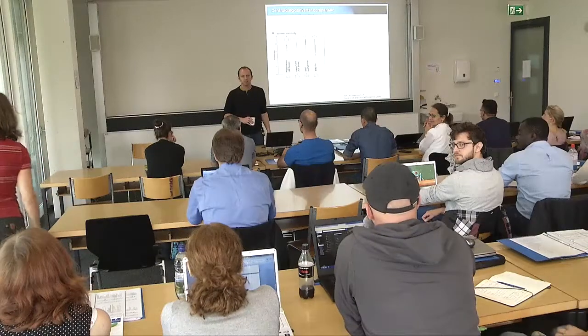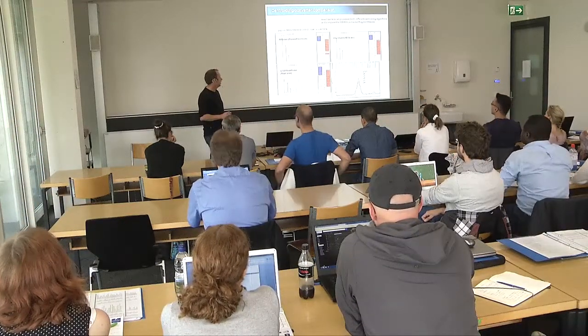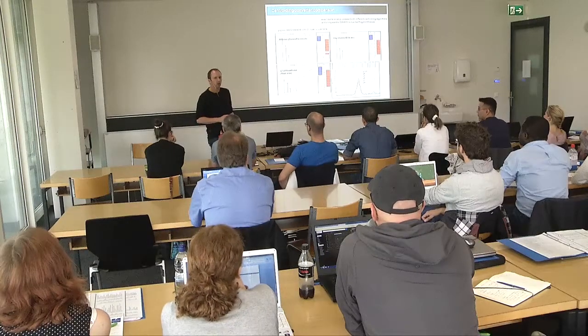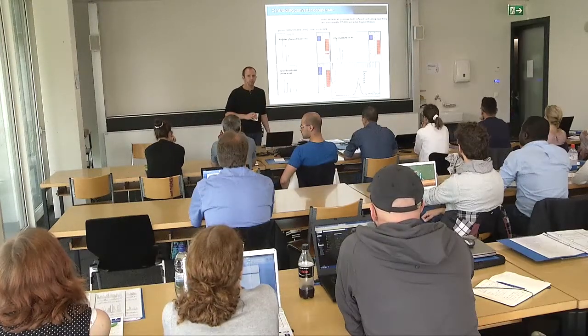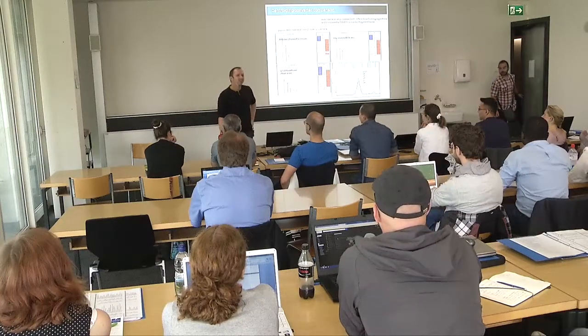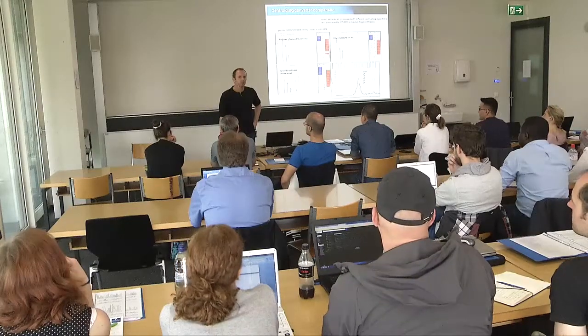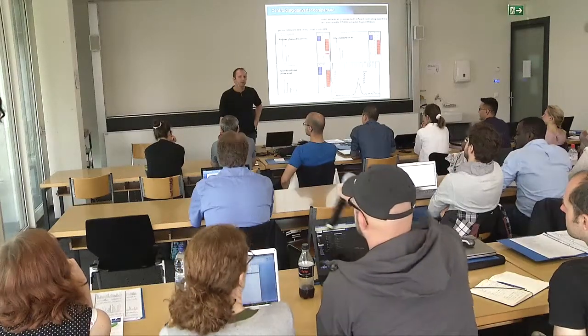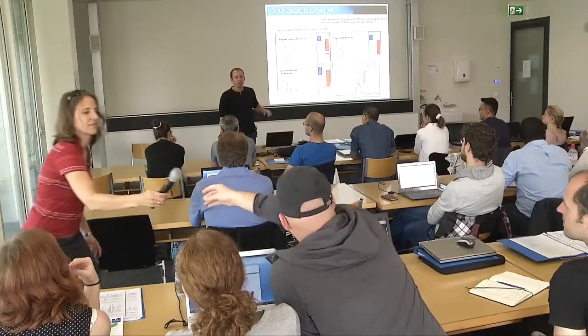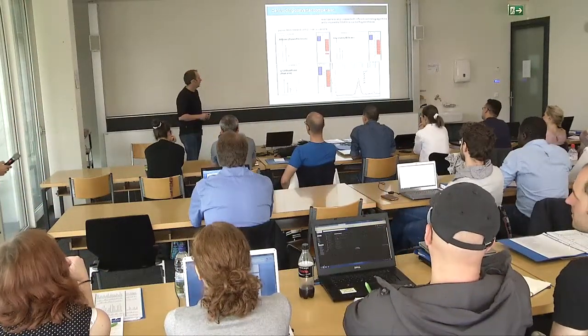If you go back one slide. Yeah. Actually, so this is for 5600 data, I guess, right? So yep, for TOF data. Have any recommendation for QExactives, which algorithm to pick? I don't. So I think this would be a good question for Jarrett when he comes back, or for Lucas Reiter, who will also, these two guys have done a lot of swath type analysis on QExactives, so maybe we can hold that question for them.